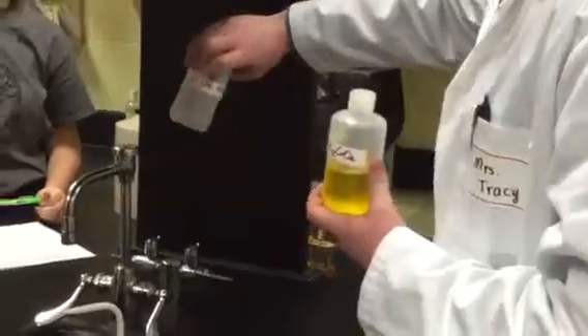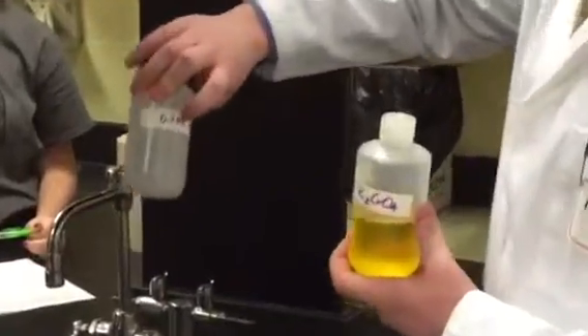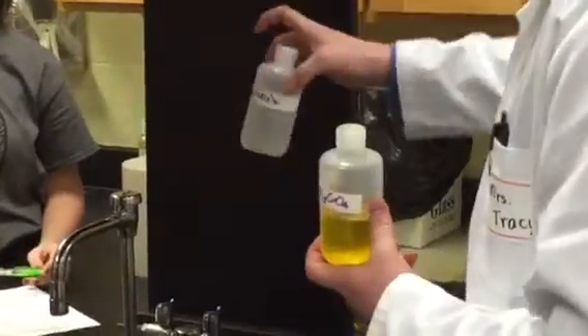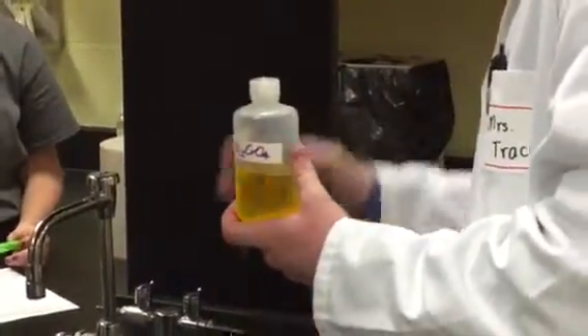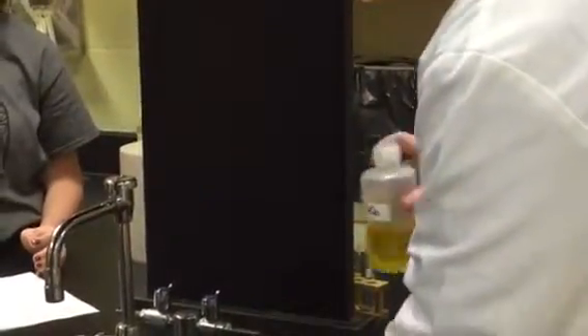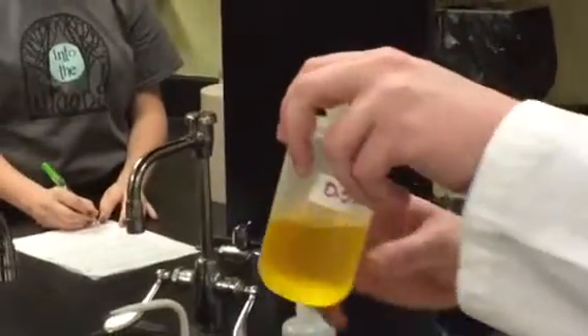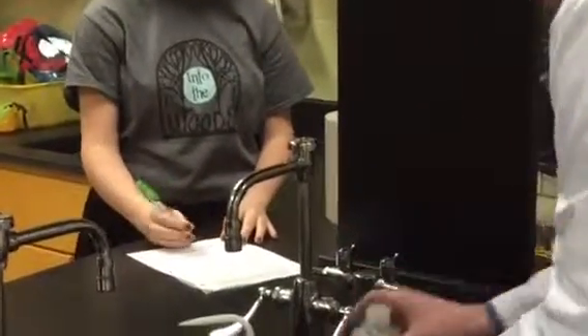So just in the bottle alone, what does this look like? Plain old water, right? So what would you describe it as? Clear, transparent. So make sure you guys are writing this down. Clear, transparent is the lead nitrate. In this bottle here, what does this look like? Yellow, clear. So these two are aqueous, both of them.